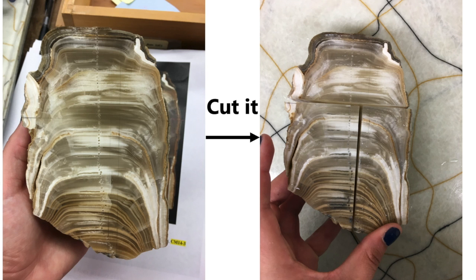Now I'm going to quickly walk you through what exactly I'm putting in the mass spectrometer to measure. As I mentioned before, my project is reconstructing climate conditions in the Midwest, specifically from a Wisconsin cave. What you're looking at here is a cave stalagmite from that Wisconsin cave. If you cut open a stalagmite, you can see that there are these distinct growth layers, which I'm pointing at here.